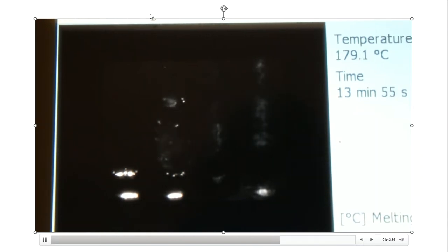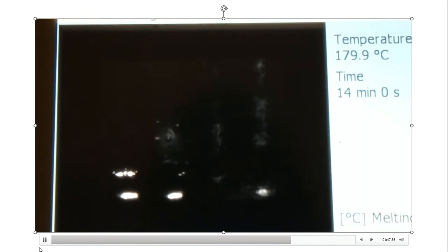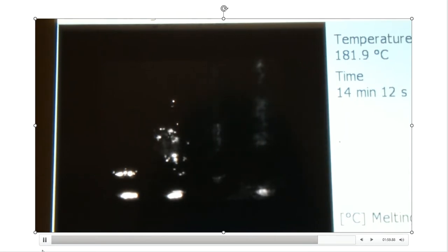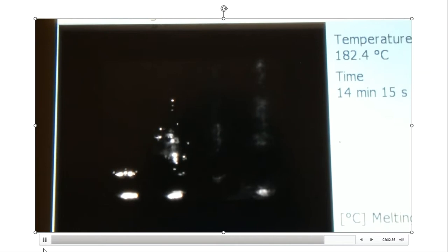Normally we would have a third and maybe fourth capillary to average. The wide range between the two melting points is typically a problem when product is not 100% dry. You're now seeing movement in those crystals — they are melting. Look at the screen to determine what temperature they're melting at. We'll go with an average, and then we're off to the final part of the laboratory, which is titration.